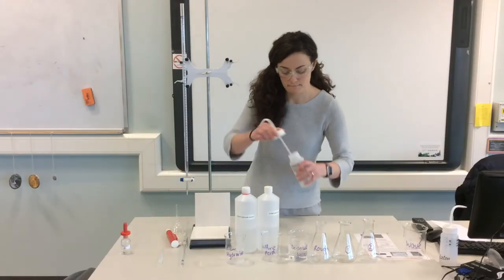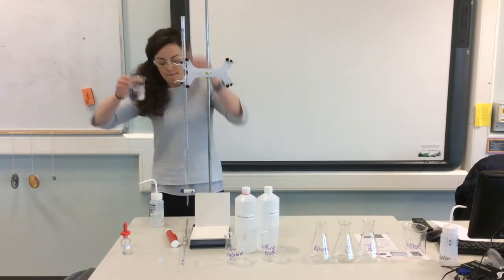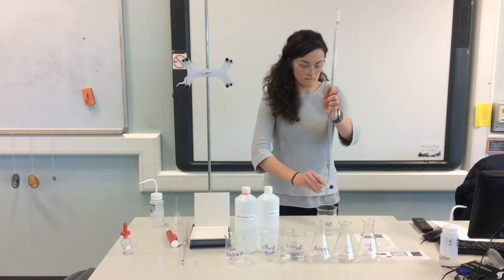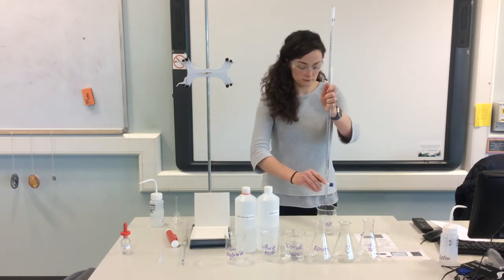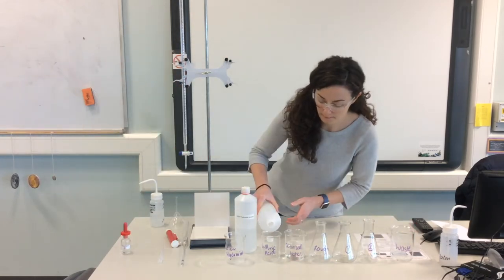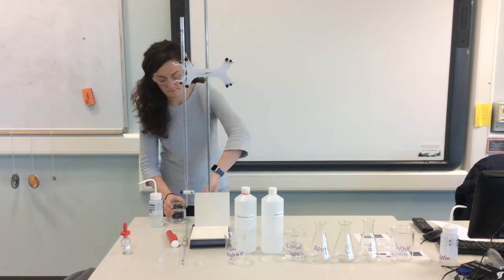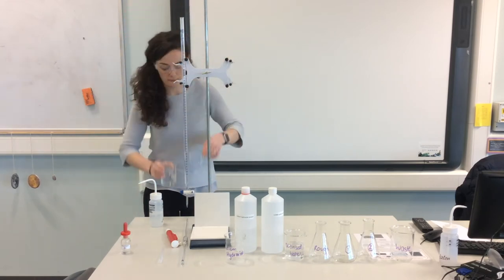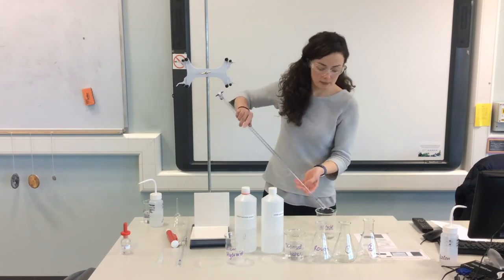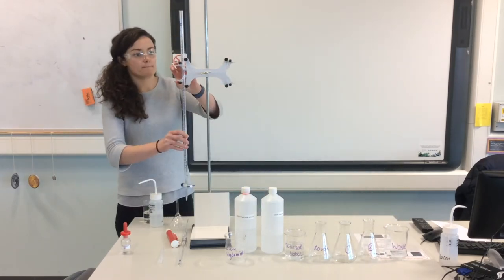So before we start our titration, we must prepare our apparatus. I'm starting here by rinsing my burette. I do that first of all with deionized water by partly filling it and pouring some out into a waste beaker, and rinsing the jet also by opening the tap. Then you want to rinse it with the solution you're filling it with. The burette, it's always a standard solution, the solution you know the concentration of. Again, I partly fill it, remove it by pouring into a waste beaker and rinsing the jet as well.